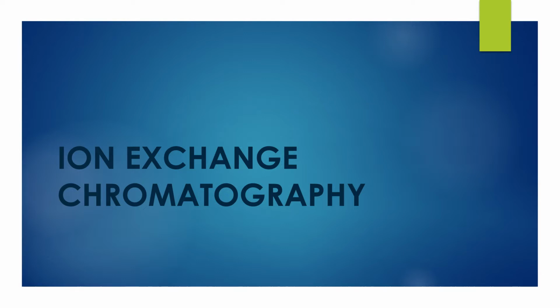Now, how is ion exchange chromatography different from other chromatographic techniques? In this type of chromatography, size of the particle doesn't matter. Only the charge on the particles matters. So with this, ion exchange chromatography is of two types, cation exchange and anion exchange. So let's get started with a brief discussion about this technique.